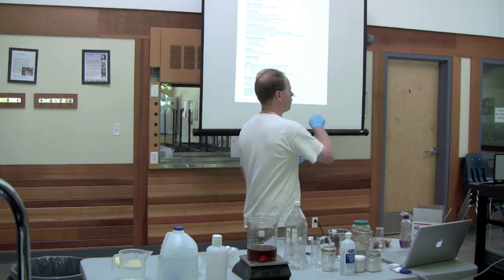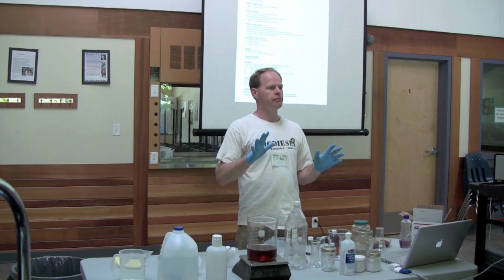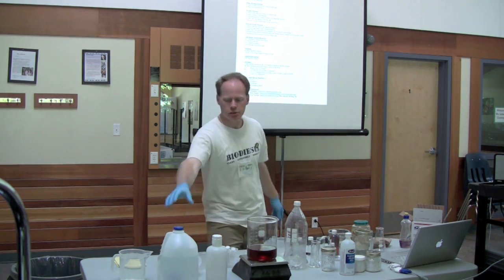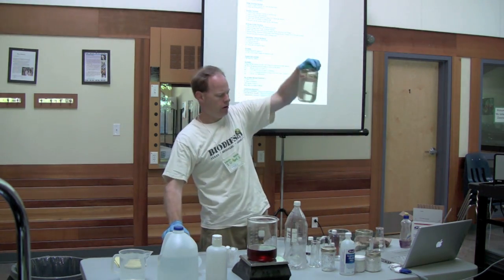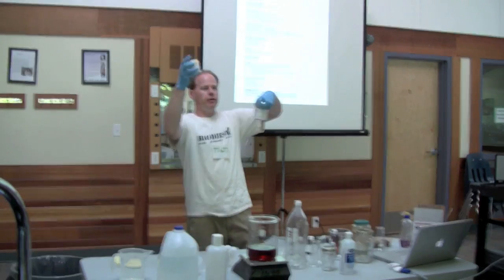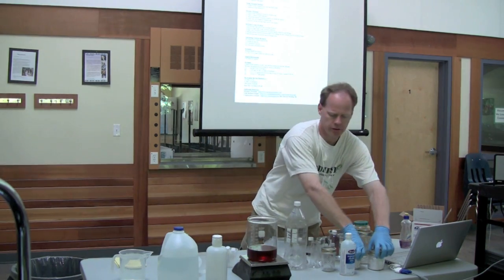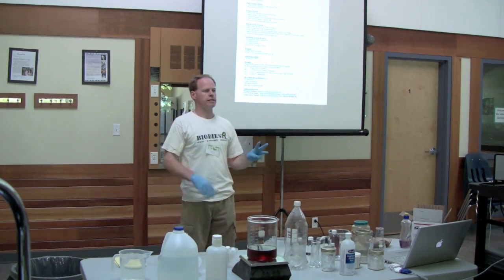I don't have my whiteboard, so I can't mark the thing out, but here is the basic recipe for those that didn't go: when you make biodiesel, you take waste vegetable oil, you take methanol, or ethanol, depending on your social consciousness lately, and sodium hydroxide or potassium hydroxide. Both will work. We're going to take a strong base. I'm going to give you a really quick chemistry lesson for those that didn't see it.